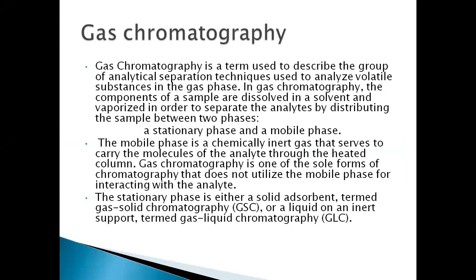Gas chromatography is a term used to describe the group of analytical separation techniques used to analyze volatile substances in the gas phase. In gas chromatography, the components of a sample are dissolved in a solvent and vaporized in order to separate the analytes by distributing the sample between two phases, stationary phase and mobile phase.